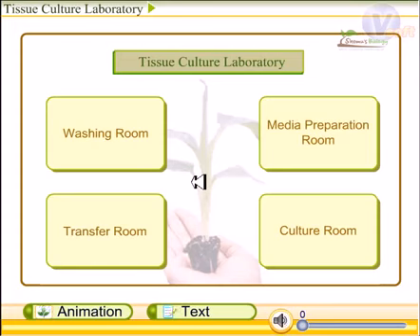Otherwise, if we develop a plant in this tissue culture process but the plant cannot grow in the soil, it will be a wastage of time, wastage of money, and all these things. So we must produce a plant which can grow in the soil. So that's why the whole process is rechecked when we place them in the soil under the controlled environment of the greenhouse.